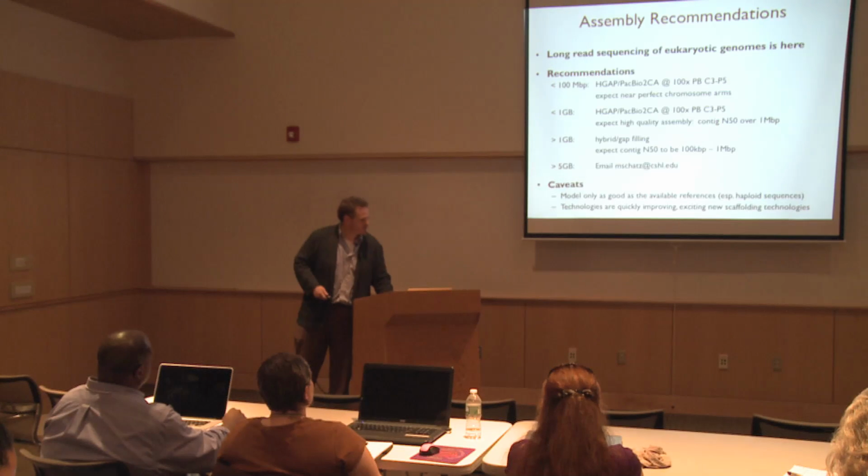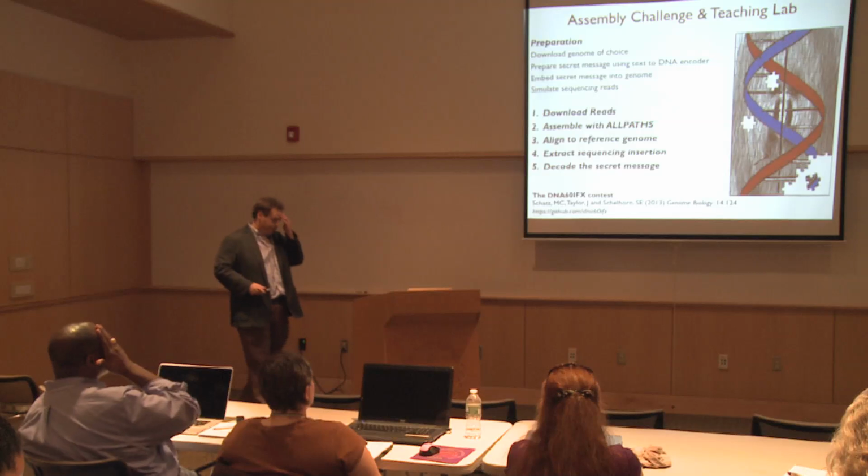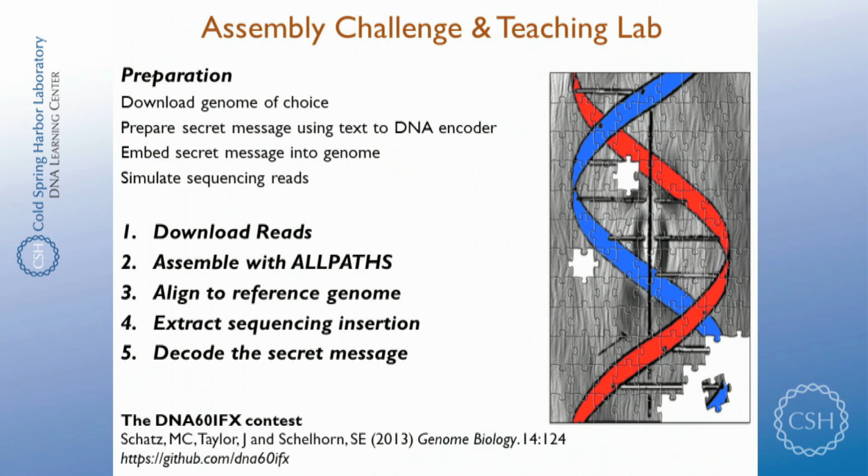And then because there's a lot of educators in the room, one really effective thing as a training exercise, one thing that I've set up, and you can read about in this paper here, is that a year and a half ago was the 60th anniversary of the publication of The Structure of DNA. So we ran this fun little contest where we set up these different genomics challenges to try to teach people about genomic analysis, and part of this was genome assembly.